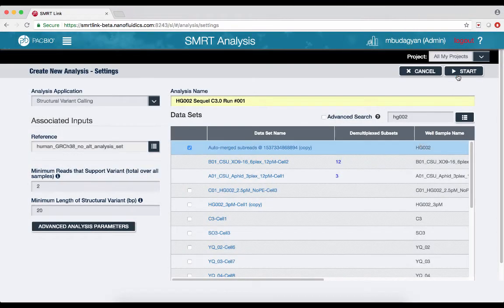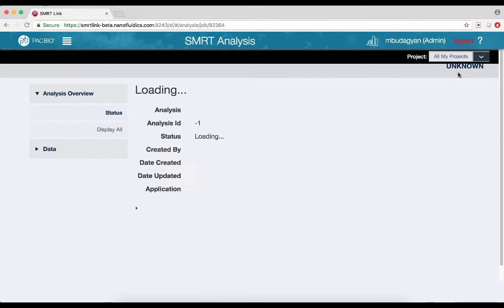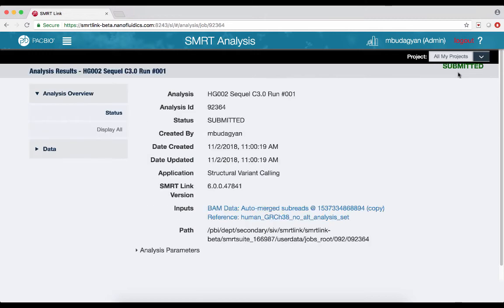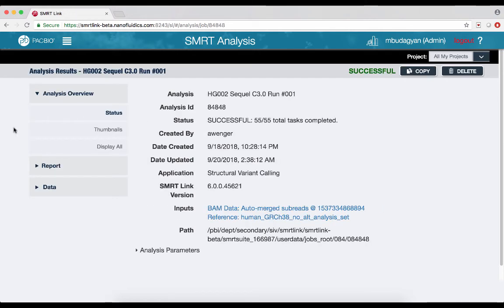Click Start to launch the analysis. Once the analysis completes, open the report to view the results.